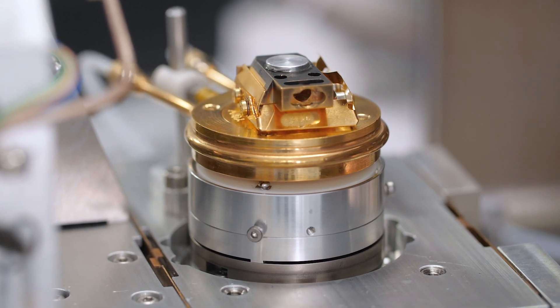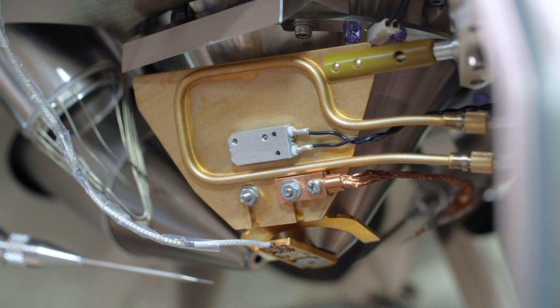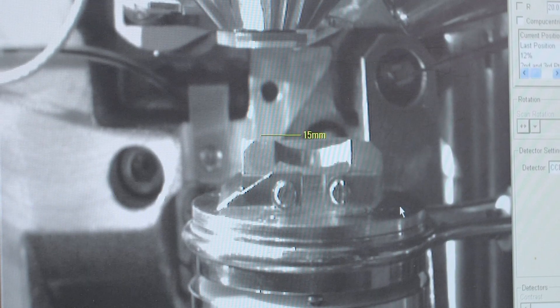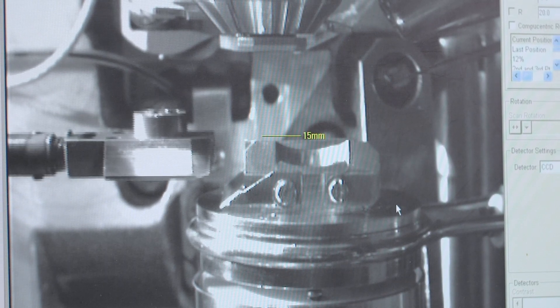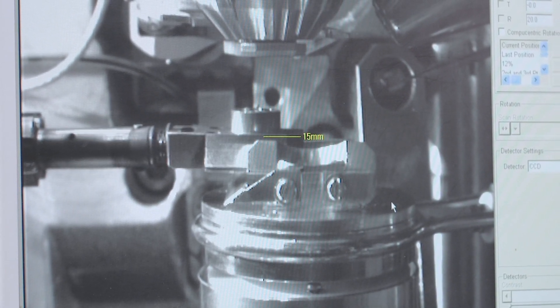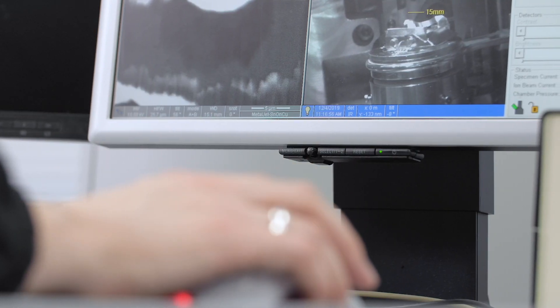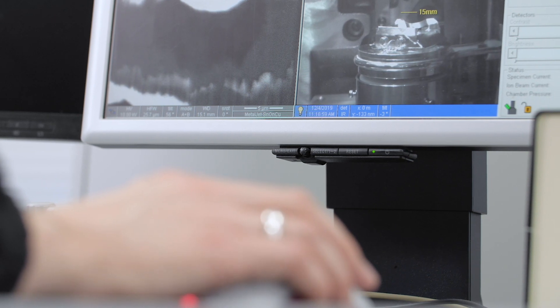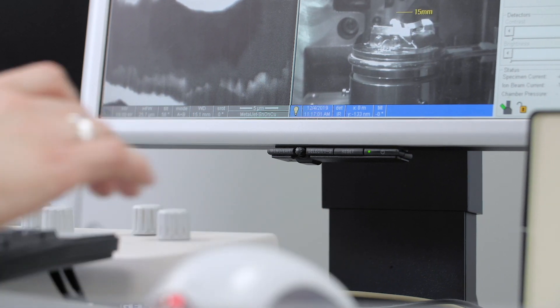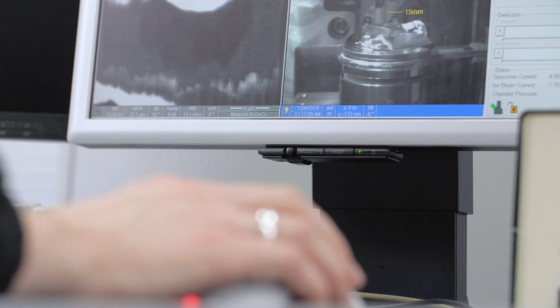For cryo-FIB applications, a new cryo-rotate stage is being developed. This allows temperatures of minus 180 degrees C at the sample and provides continuous 360-degree bi-directional rotation. This is very useful when thinning lamella — once you have cut the first side, in normal operation you are cutting blind to cut the other side. Being able to rotate the sample by 180 degrees lets you see the other side and check for curtaining or other artifacts.